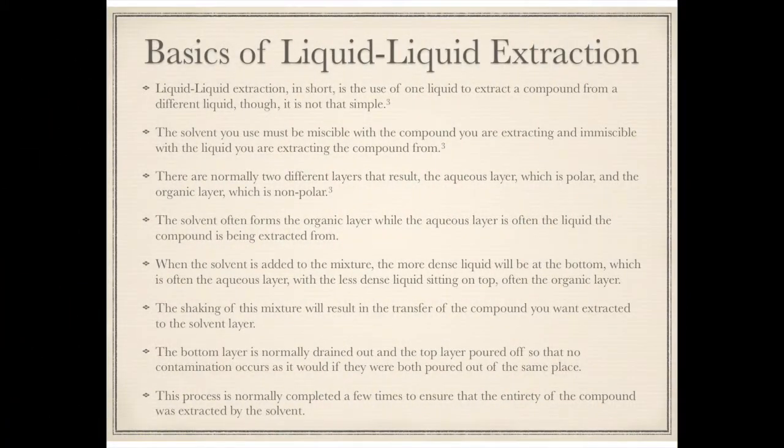Here we will see the basics of liquid-liquid extraction to help you understand the process occurring throughout the demonstrational portion of this video. Liquid-liquid extraction, in short, is the use of one liquid to extract a compound from a different liquid, though it is not quite that simple.